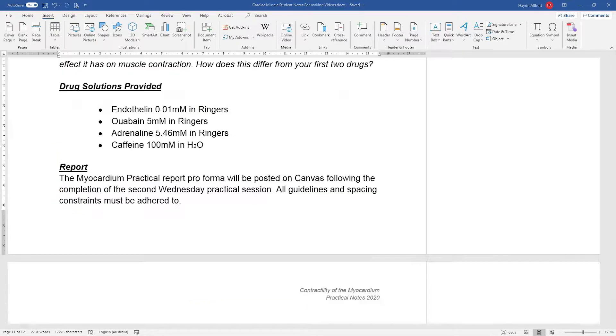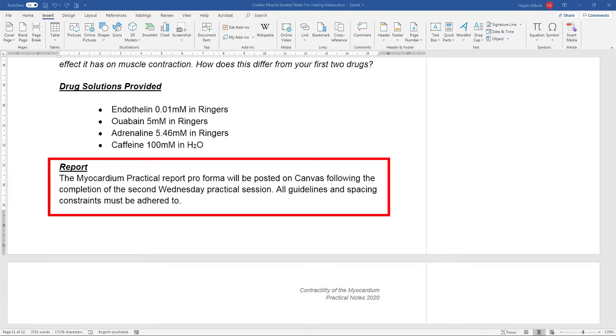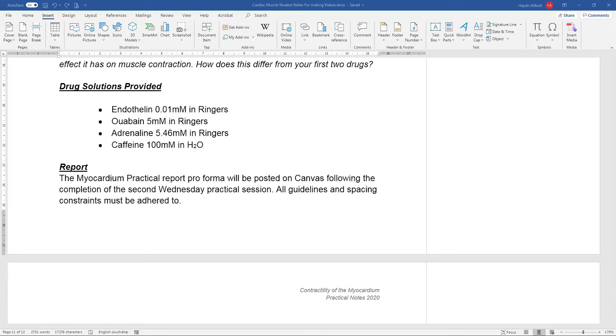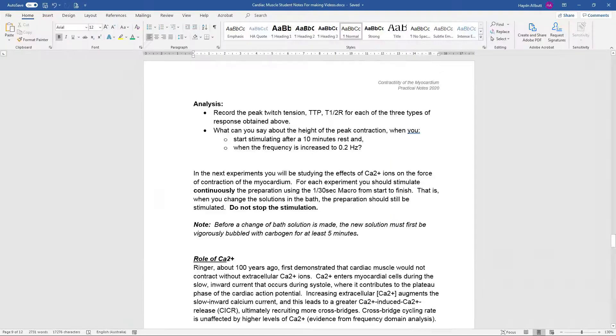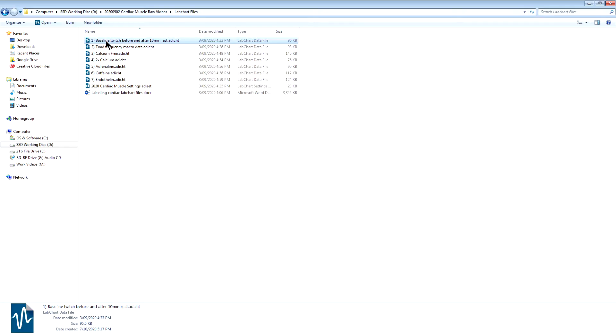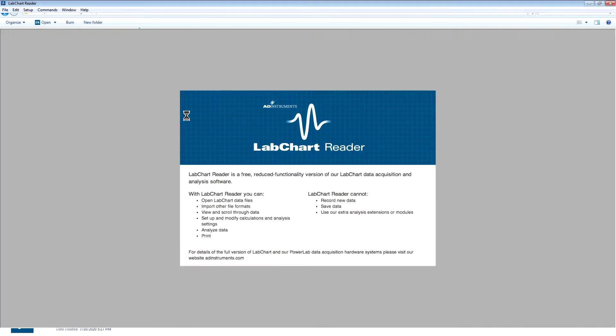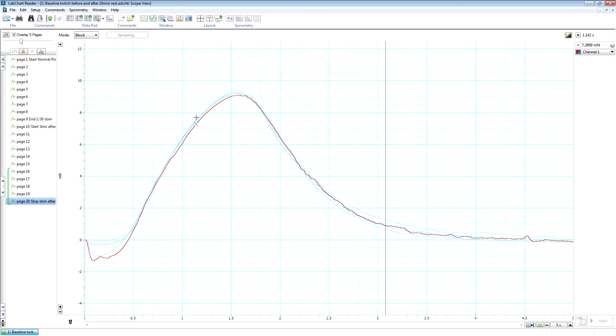Write up the report, of course, and so the only bit that we've done is perform the parts that need the specialist equipment, since you didn't have access to that. Now I'm just going to open up that first file so that we can talk about a couple of things and I'll show you a couple of points and tips and tricks for using the software.